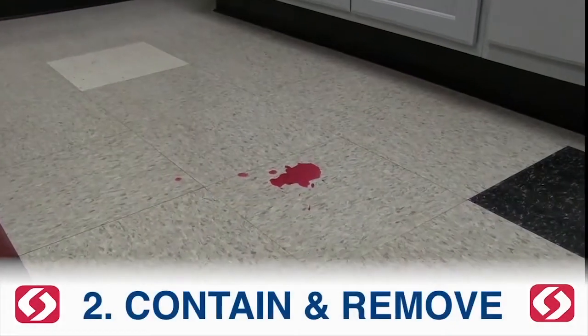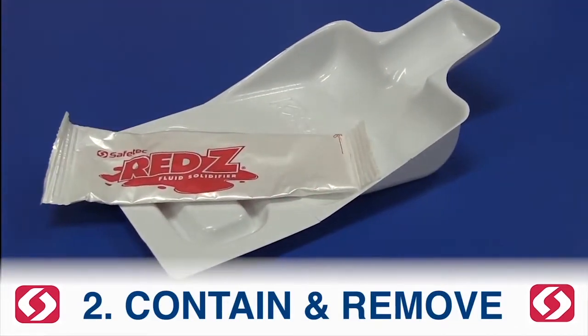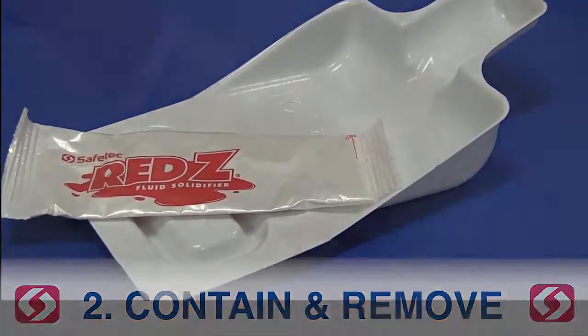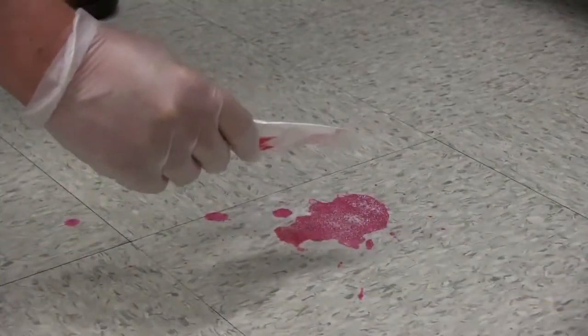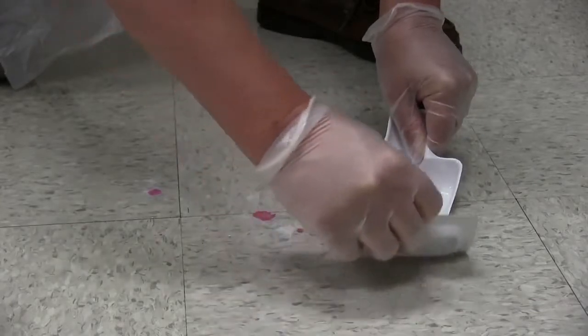Contain and remove. To effectively contain and remove the spill, a solidifying agent like Red Z and a scoop and scraper are to be used, and the spill contents are to be disposed of in a red biohazard bag.